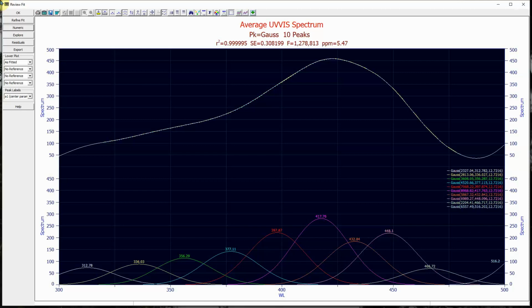Any spacing appreciably narrower than that will be wasted. It will seriously inflate the full permutation fitting times, and in the extreme it can result in the fitting of noise. For our purposes here, we'll choose 5 nanometers since this will give us a nice set of wavelengths for the modeling.